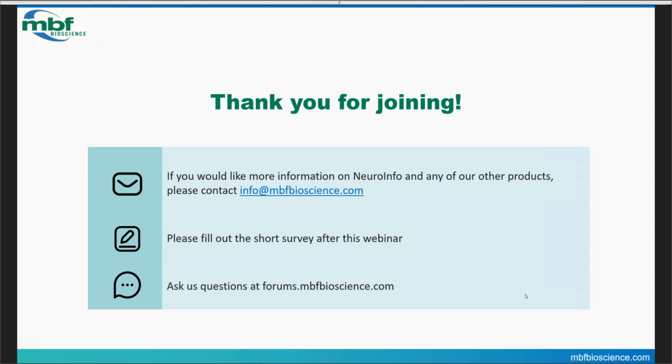Cool. Thanks, Chip. And I guess one last really take-home question is, what's the rate of the workflow? Brains per week from front to back, some timings on all of this. So I can address that as well. The sectioning in all takes about half an hour per brain. The immunohistochemistry using these trays, and again, if people have questions, I don't mind you contacting me about the trays, is trivial, but it's overnight.